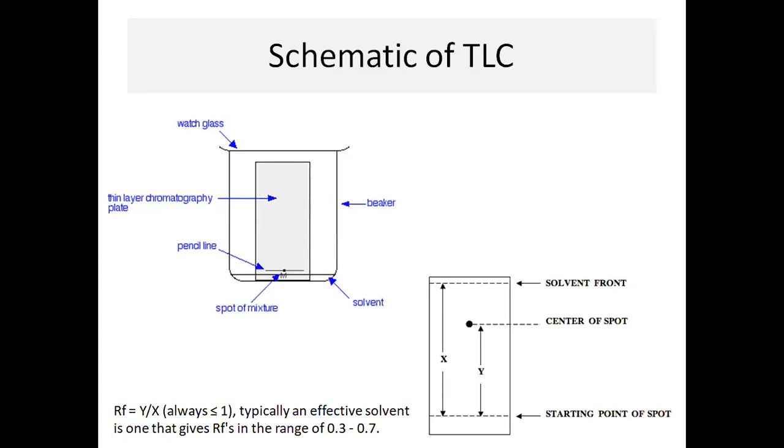Your sample is moving almost with the solvent front. That is to say, it is not getting retarded by the stationary phase.